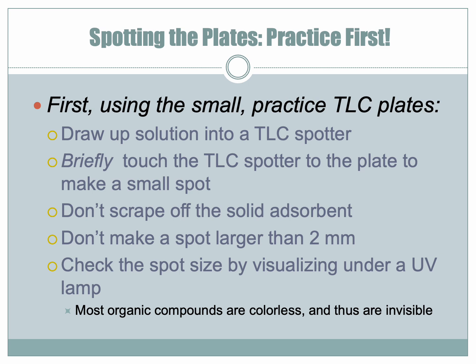Because of course, once we spot our plates, the spot is almost invisible. You can't even really see what you did. So the UV light will help, the plate will fluoresce, and so we can see the spots that we make if we illuminate the plate with a UV light before we spot.